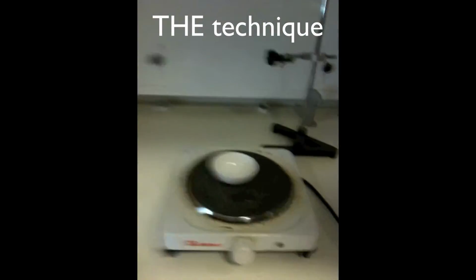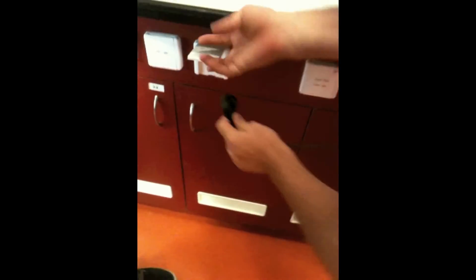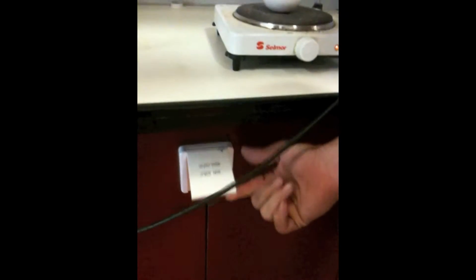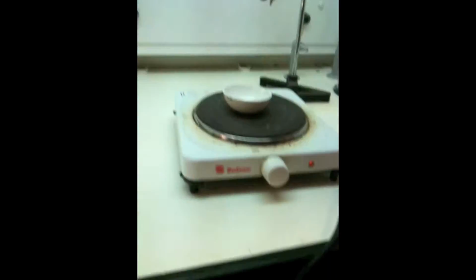Okay, I'm going to plug this in. You notice I'm plugging this in? Watch the technique. Plug in like this. See, that would be wrong, so you do it this way, face to face. Then of course I go over here and I do that, and then I use my super huge muscles to pull down this door.